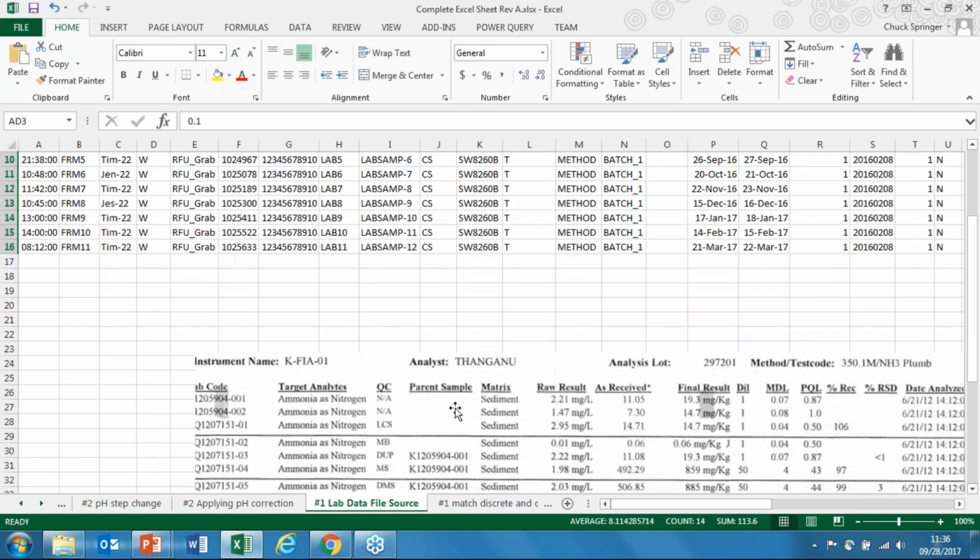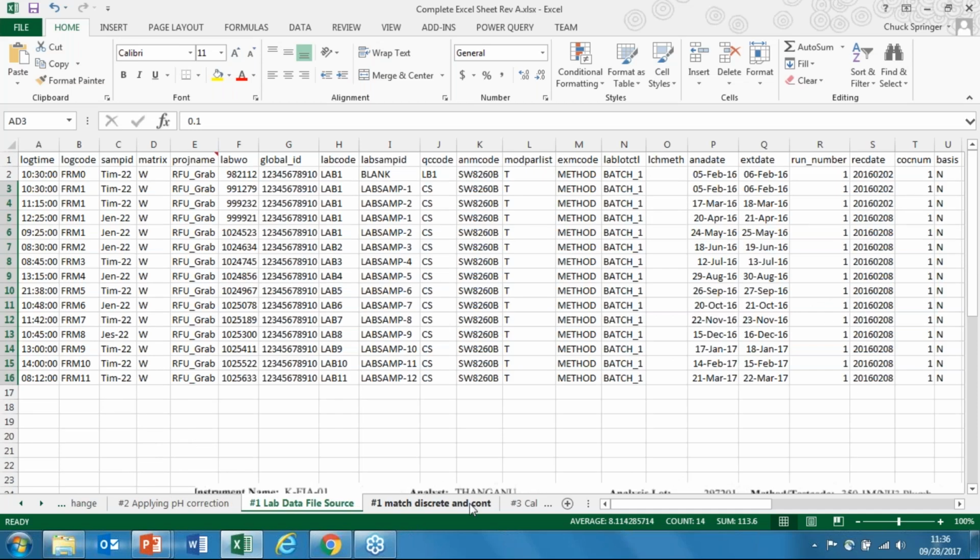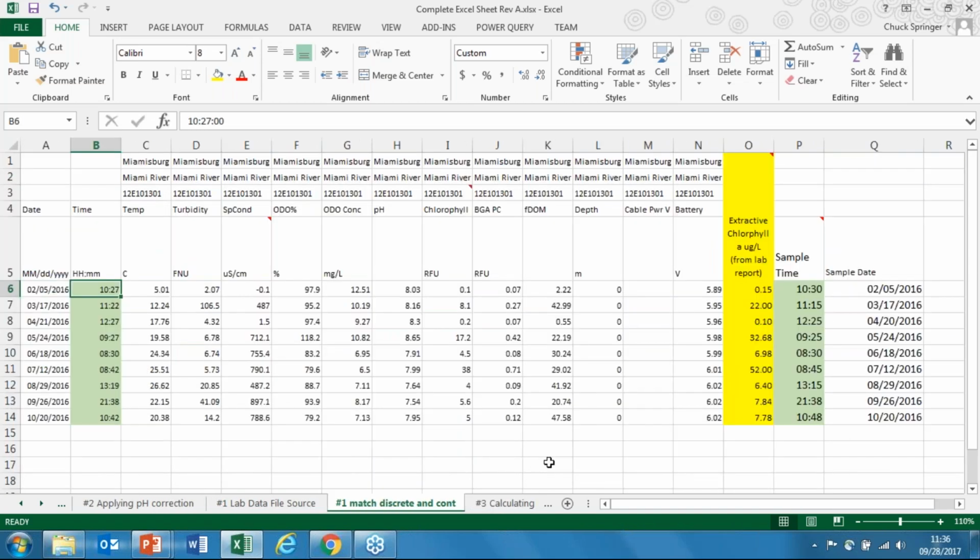If you're less fortunate, and a lot of labs, even in this day and age, still do this, they deliver that data back to you in PDFs or even on paper. And in this case, there's really, unfortunately, no two ways about it. The task at hand is keying in all of these results into a spreadsheet or into some system, and it's opening things up to transcription errors and all of those kinds of things with the times and with the values and everything.